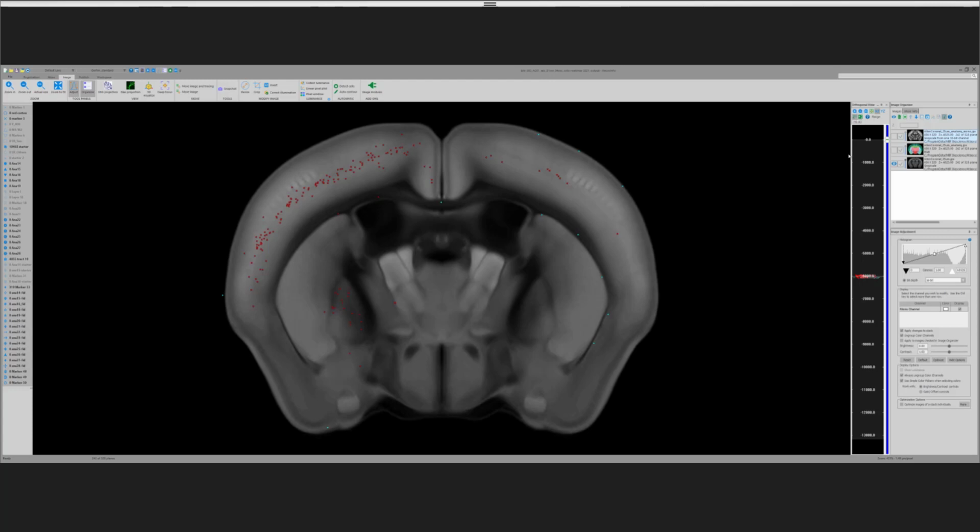We've actually done this in a publication with Mac Hooks, and what we determined was that the accuracy of the registration was, on average, about 80 microns, which when you think about it, is pretty accurate. The way we did that was to take these fiducial markers in a number of different regions of the brain and determine what the offset was between what the registration did and what the actual position was in the Allen space. So on average, it was about 80 microns.